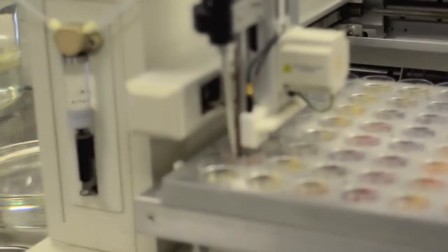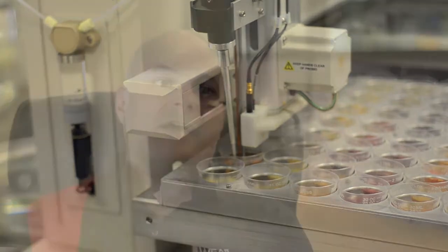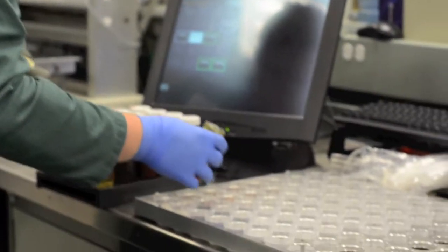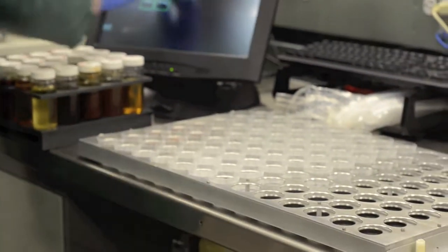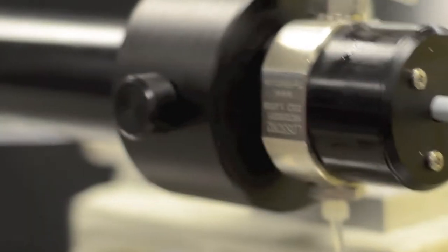When we were designing the Synergy CSEPC2, we knew we wanted to create an instrument that was designed for commercial laboratories. So in order to do that, we needed to have over 100 samples batched. We wanted to make sure that technician time was minimized for sample preparation. And of course, we wanted high accuracy of particle count data.